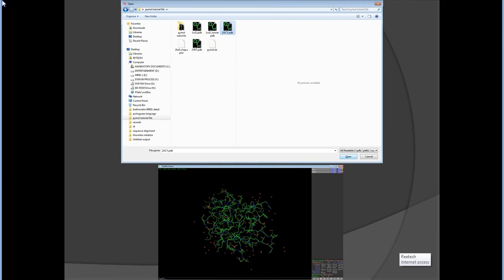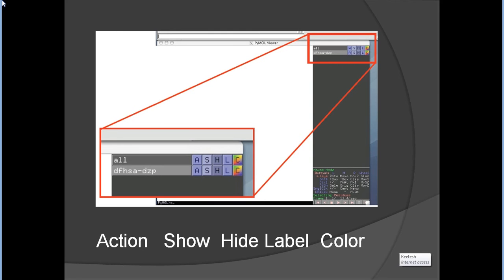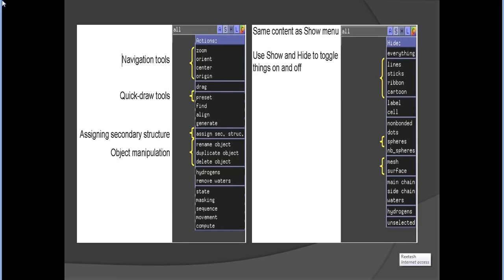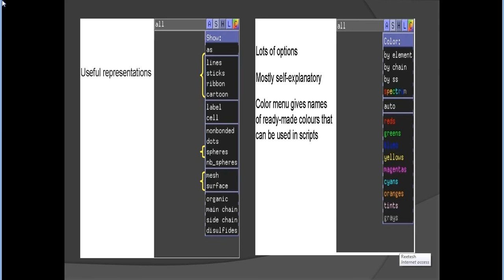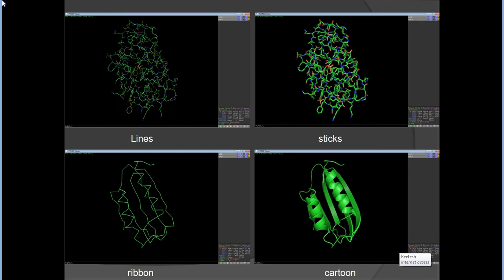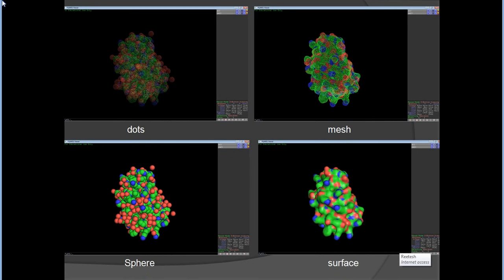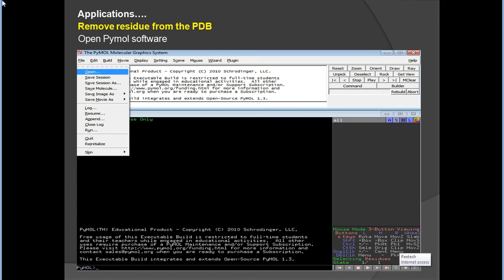This slide depicts information about what a Protein Data Bank file looks like. When you open the PyMOL software, in the upper right portion there are buttons: A for action, S for show, H for hide, L for label, and C for color. There are other navigation tools available in the PyMOL manual. In PyMOL, proteins can be shown as lines, sticks, ribbon, cartoon, dots, mesh, spheres, and surfaces.